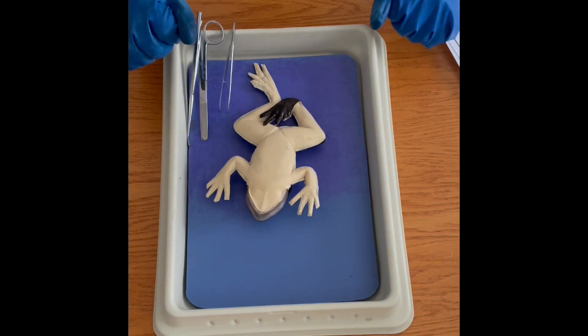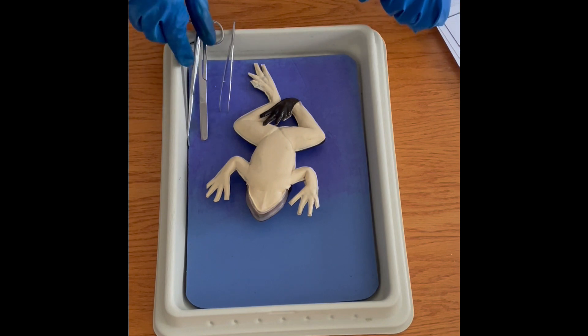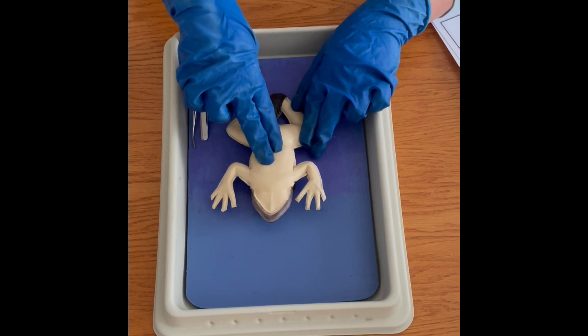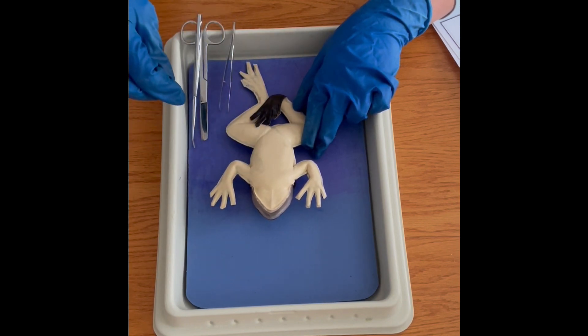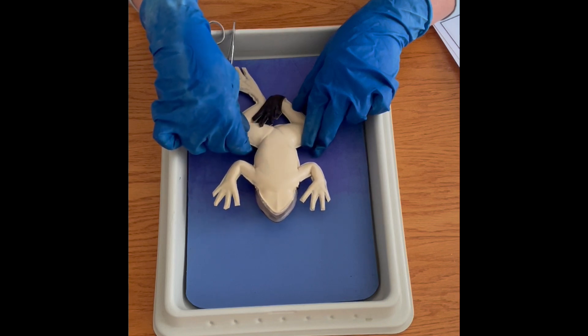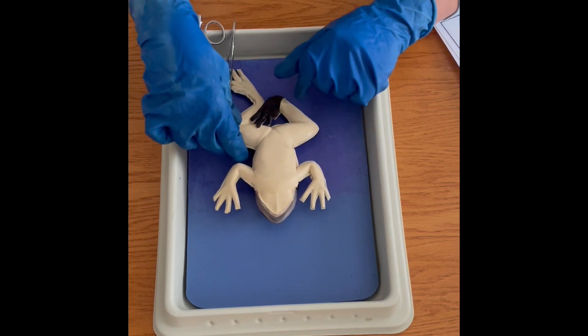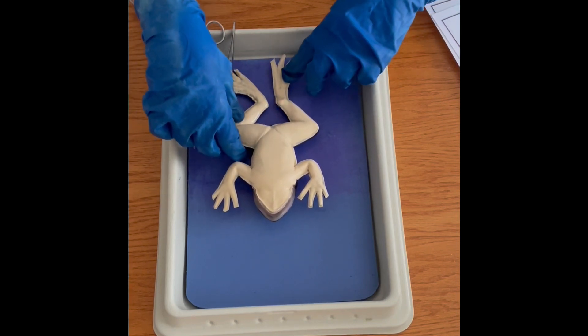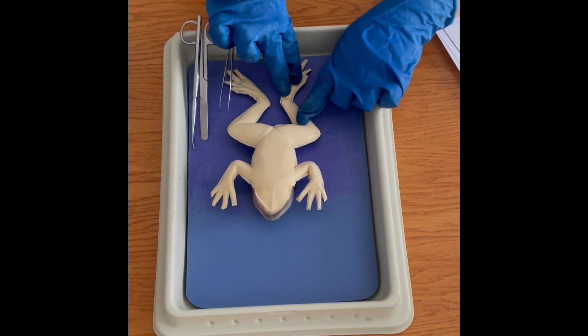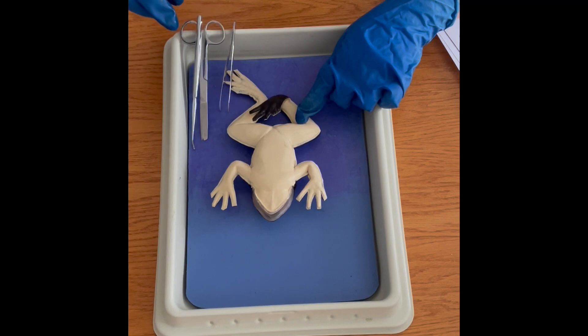Let's take a look at what we can find in the synthetic frog. When you feel the frog, it feels really just like a frog specimen — it is smooth and kind of slimy. This one foot is folded up, but sometimes that happens in real frog specimens too, so no big deal.